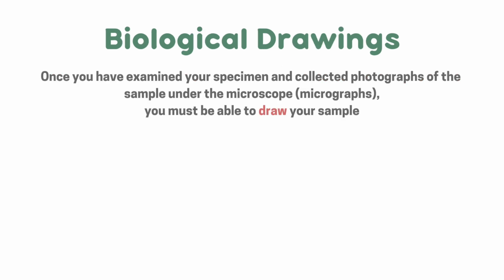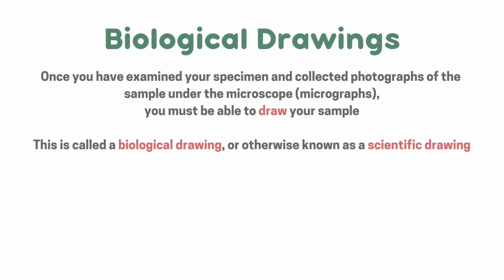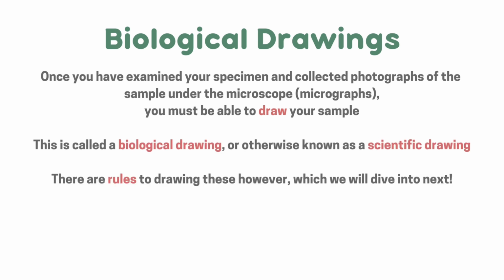Once you have examined your specimen and collected photographs of the sample underneath the microscope, also known as micrographs, you must be able to draw your sample. This is called a biological drawing, or otherwise known as a scientific drawing. There are rules to these drawings, however, which we will dive into next.